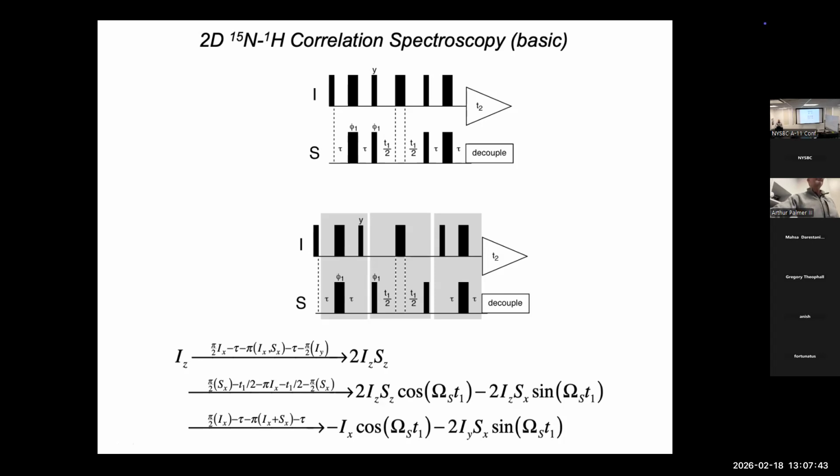So you should look back at either problem set 1 or problem set 2 where you worked these all out. And there you would have concluded, hopefully, that if we apply a 180-degree pulse to both spins, the J coupling is unaffected. So the J coupling evolves for the whole time period. One way to think about it is to think about the pulses acting on the Hamiltonian. So chemical shift, Hamiltonian is omega IZ.